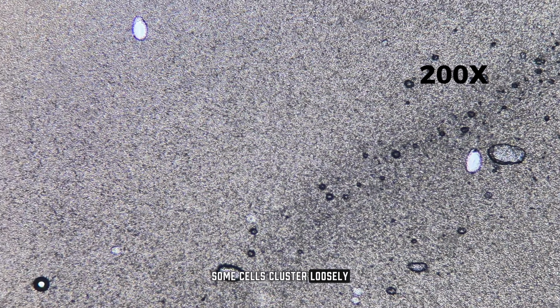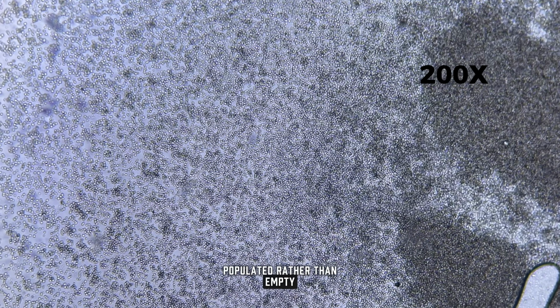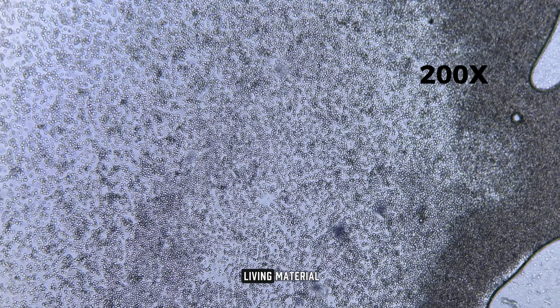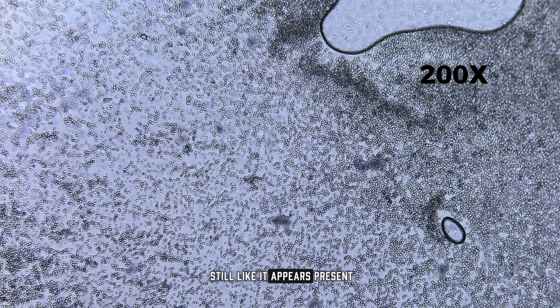Some cells cluster loosely while others remain isolated. The slide now feels populated rather than empty. At this level, yeast clearly reads as a living material rather than a passive substance. It no longer appears still, like it appears present.